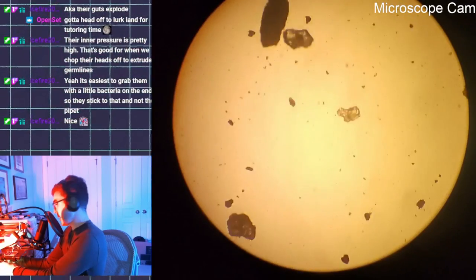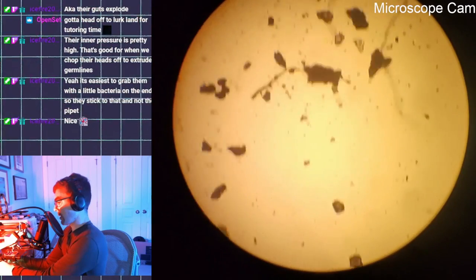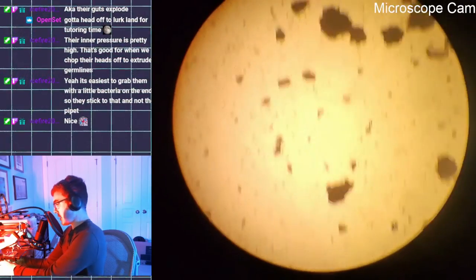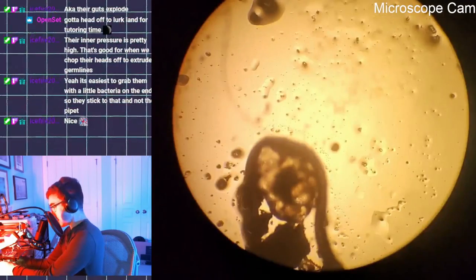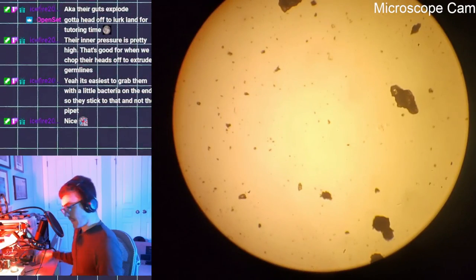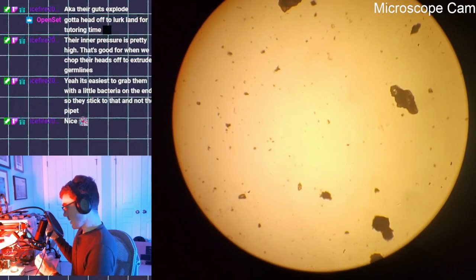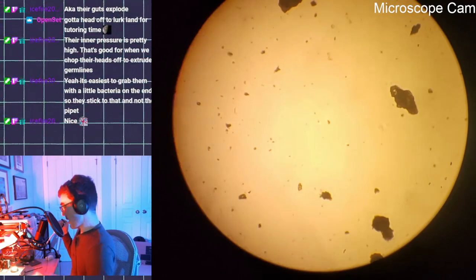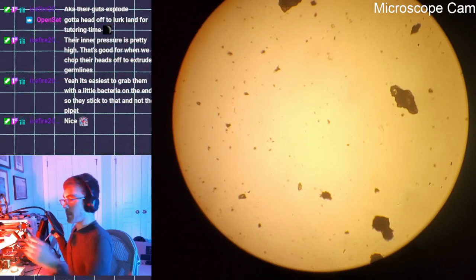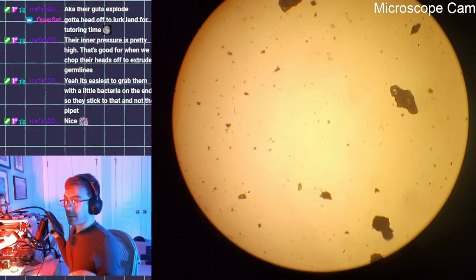Oh no. The water has done something very strange. Shoot. Yep. Okay. Gonna have to add some more, I think. In my attempt to not squish them, I added some sand, which I don't think was all the same size, and so the cover slip was uneven, and the water flowed away from where the worms were. I hope they didn't get stuck.